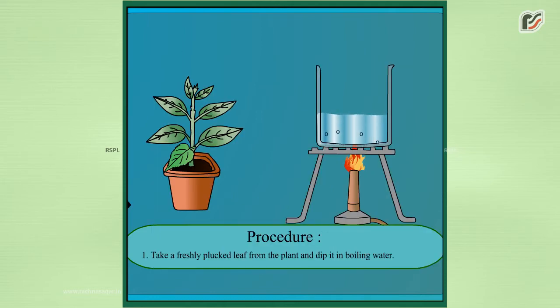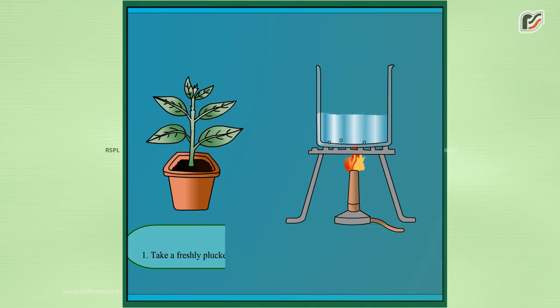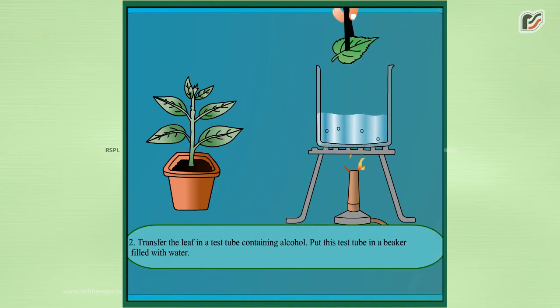Procedure. Take a freshly plucked leaf from the plant and dip it in boiling water. Transfer the leaf in a test tube containing alcohol.